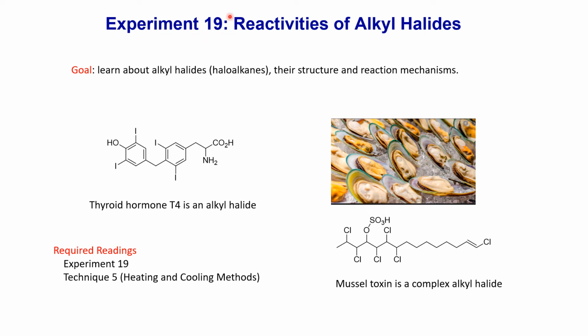In experiment 19, we will learn about reactivities of alkyl halides. The goal is to learn the basic structure of alkyl halides, also known as haloalkanes, and their reaction mechanisms. So alkyl halides can be found in nature as well.